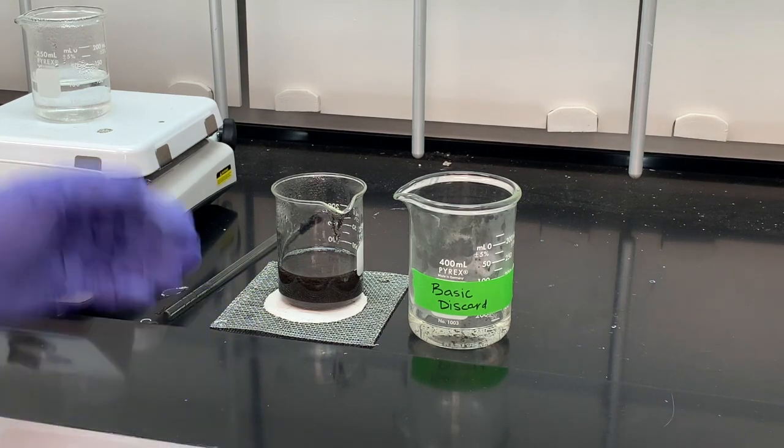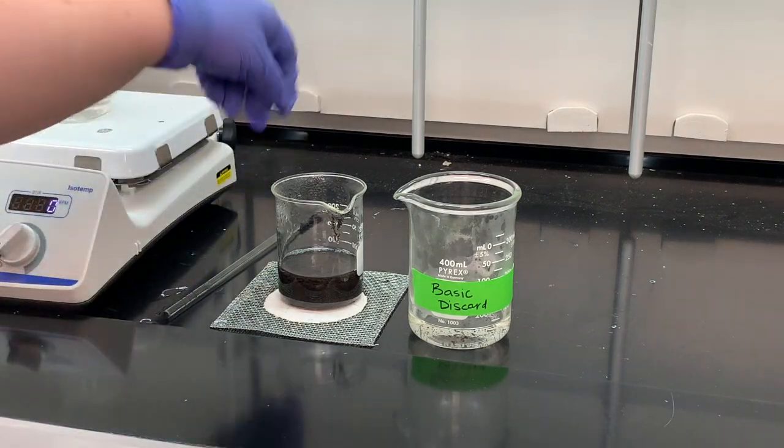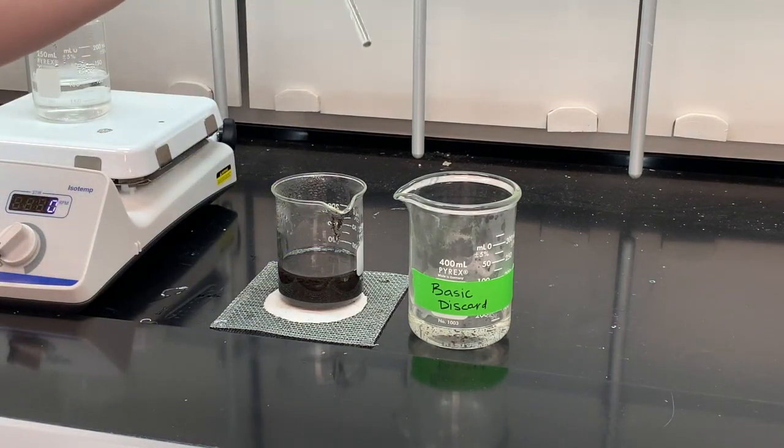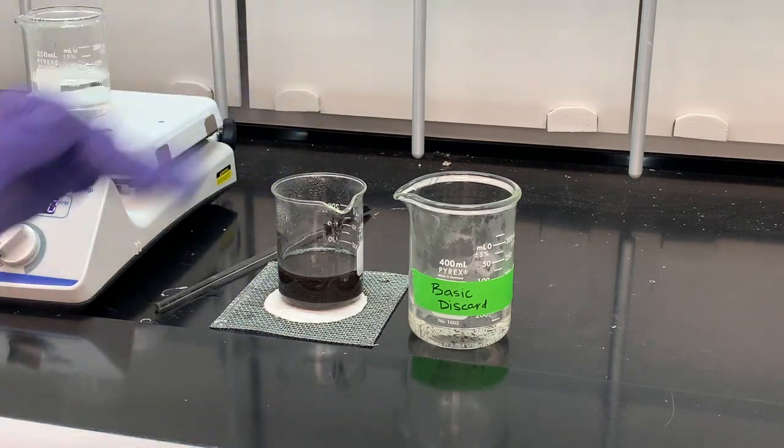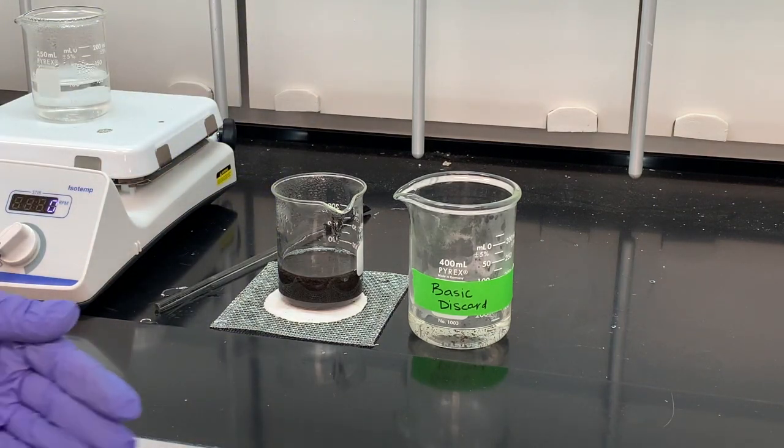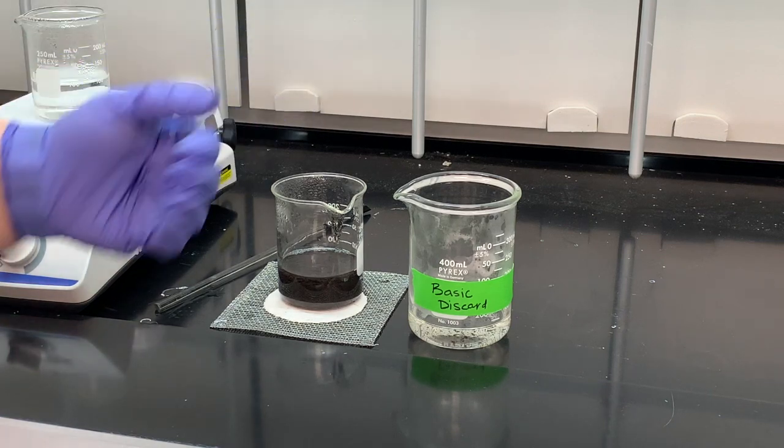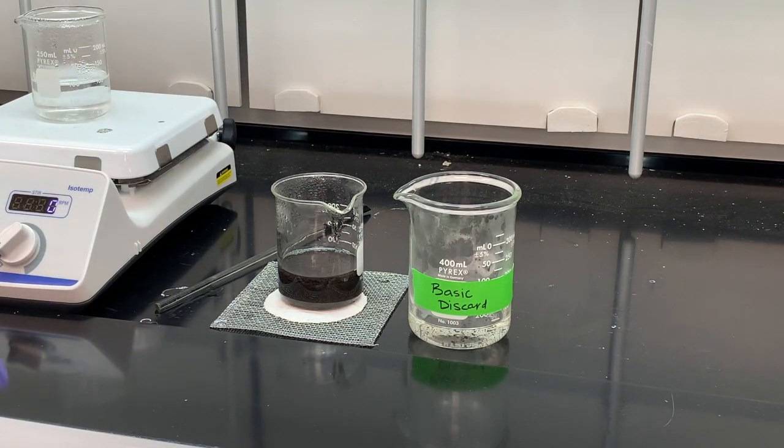So when you account for errors or if your percent yield is very low, think about the transfer steps. I set this stirring rod in there. I have some black stuff on that stirring rod. That's where some of our product went. It sticks to the sides of the beakers. We're going to move it from this beaker to another container later on. Think about those transfer steps when you're thinking about percent yield and why it might not be as good as you would like it to be.